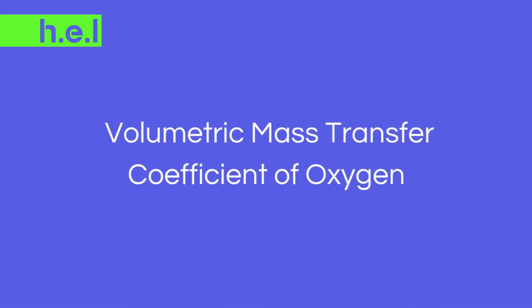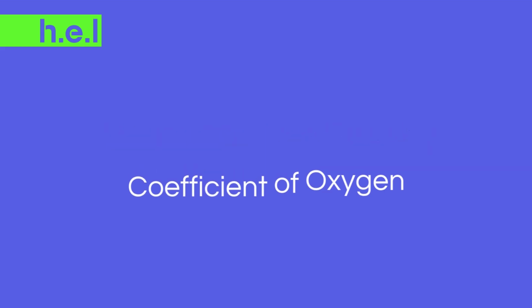Today we are going to be talking about a critical parameter on the scale-up processes in bioreactors. Today we will talk about the volumetric mass transfer coefficient of oxygen, or kLa.